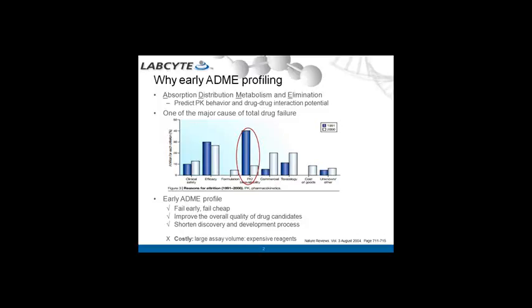So in the past 10 years, the overall quality of drug candidates has improved dramatically. Now less than 10% of total drug failure is contributed by poor ADME properties. Early evaluation is expected to not only improve overall drug quality, but also shorten the drug discovery and development process. When a drug fails early, it fails cheap. This is why it is extremely important to keep ADME assessment as early as possible.